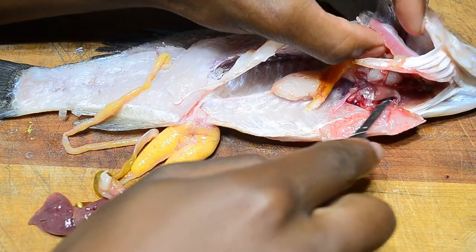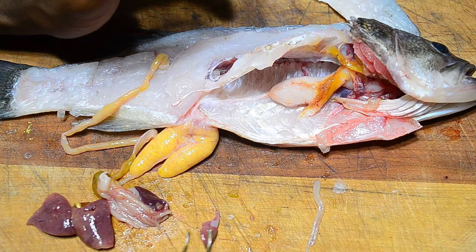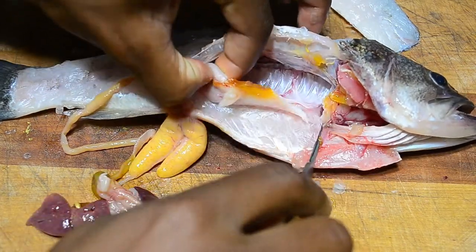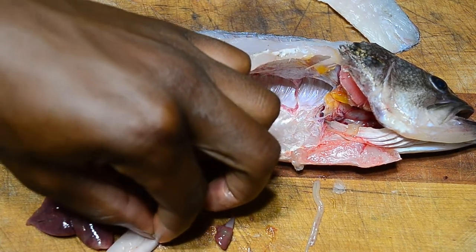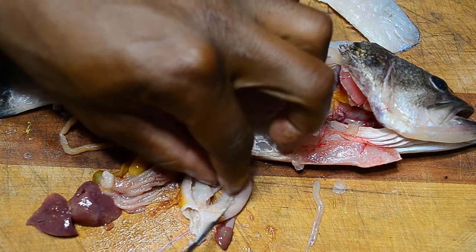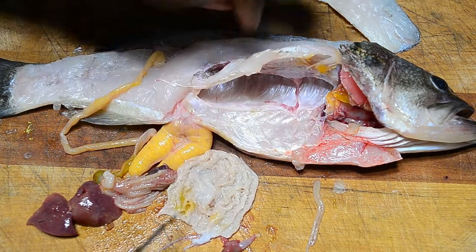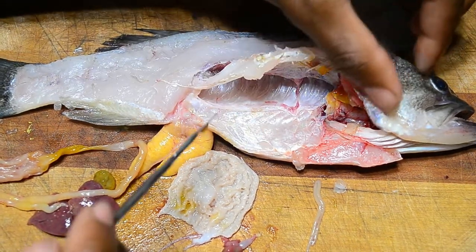Here is the heart right there, and this is the stomach — let's see what the last thing it ate was. The stomach feels empty, and that's because it pretty much is. The stomach contents are nothing — completely empty. Looking through the intestines, there's nothing in here either. This bass was clearly very hungry when it hit my lure.